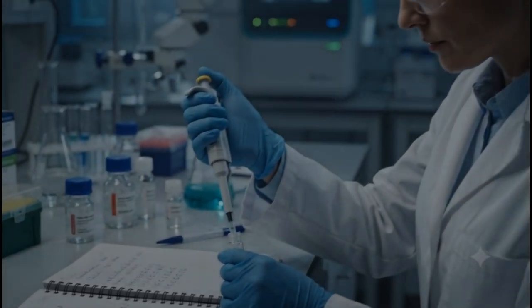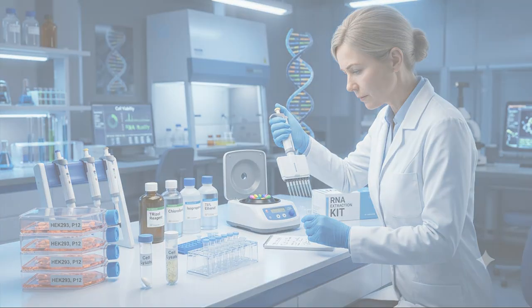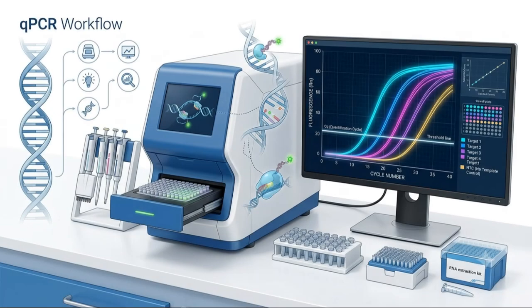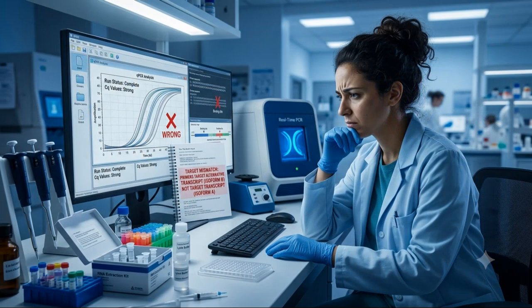Imagine spending over $100 on a custom qPCR assay, waiting almost a week for your primers to arrive, carefully extracting RNA, running your qPCR experiment, getting beautiful amplification curves, only to realize that your primers amplified the wrong transcript. Unfortunately, this happens far more often than most researchers think.